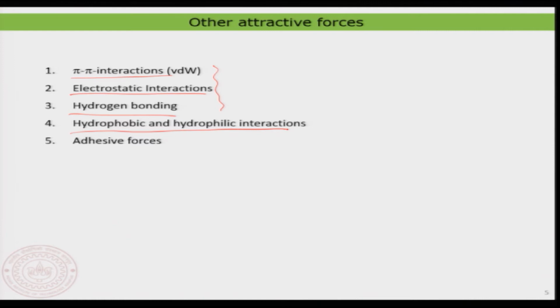But these interactions are also originating basically by van der Waals, hydrogen bonding, or electrostatic interaction, but they are much more collective or bulk type of force, or adhesive force, for example. But these are all forces that are present, and the repulsive forces are typically the so-called Pauli repulsive force, because you are actually bringing two atoms together, you always have something like a repulsion because you are trying to put two nuclei together.